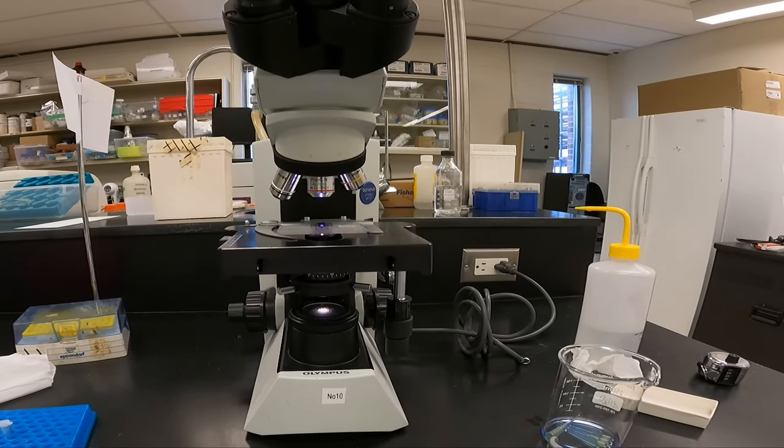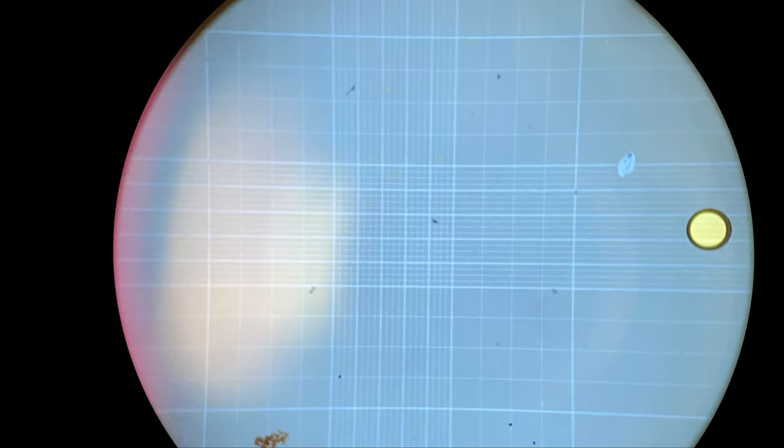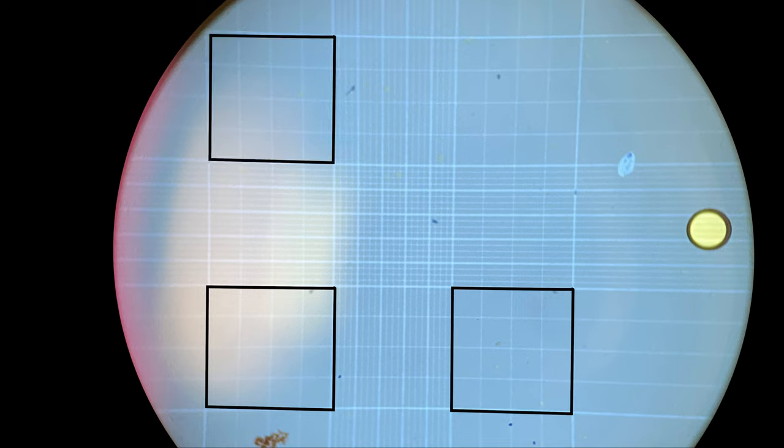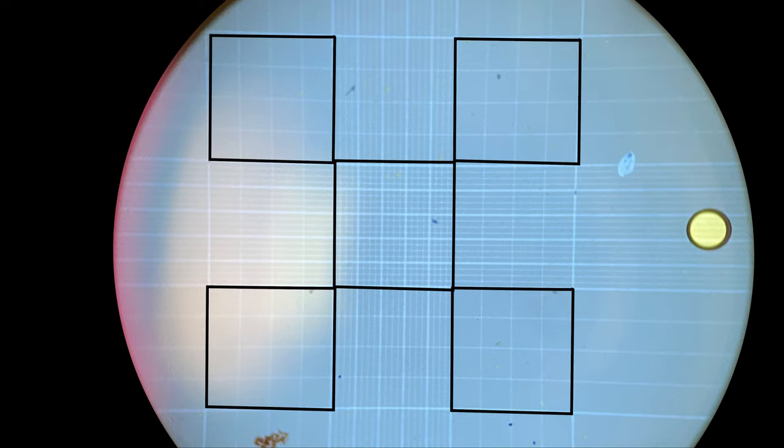There is a laser etched grid on both sides of the hemocytometer. If you look at it on low power, we can see nine P-squares. One, two, three, four, five. We'll count these five P-squares on each side of the hemocytometer. Notice the corners are four by four grids. The middle is five by five.